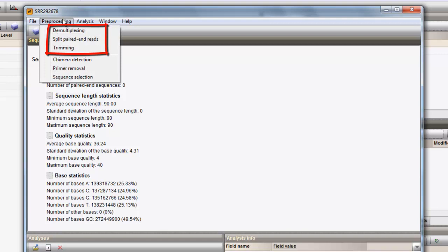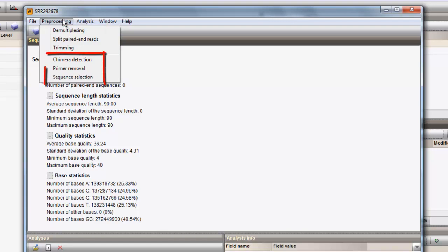The demultiplexing, splitting of paired-end reads, and read trimming are more general preprocessing actions, whereas the Chimera Detection, Primer Removal, and Sequence Selection is specifically tailored functionality to be used with metagenomics data.